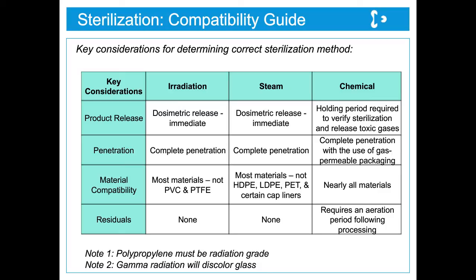Now, residuals, the only method that has residuals is the chemical sterilization method, and that's why the post-aeration process is required.